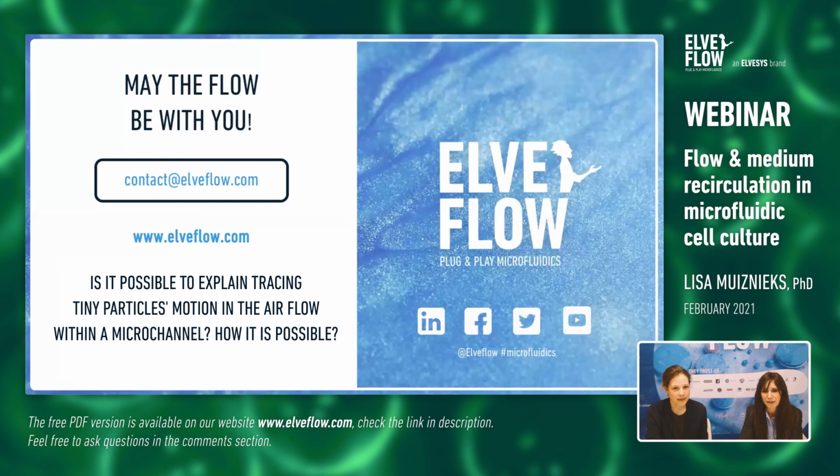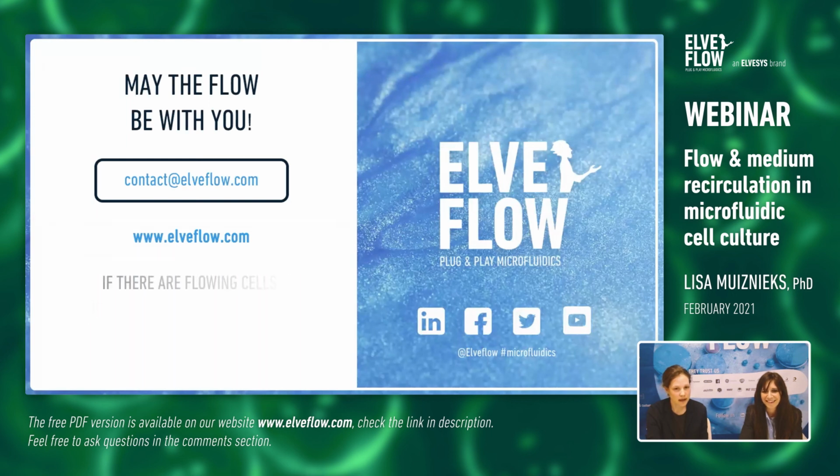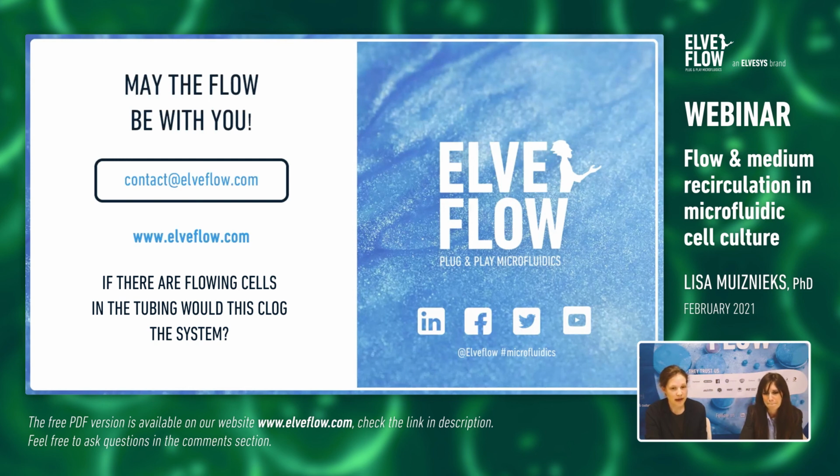If there are flowing cells in the tubing, will this clog the system? Not necessarily, but perhaps, yes. If they are dead cells that are very sticky, or if they're clumped, then they have a good chance to clog the system. Things that are aggregated have a good chance to clog. It depends a little bit on what is the most resistive part of your system, so the thinnest inner diameter that you're using. It might happen, especially the dead cells could aggregate. If they're live cells and they're added intentionally, less so.